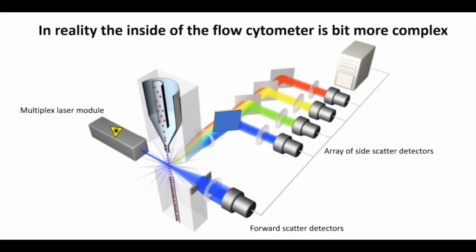So today I will discuss all about flow cytometry, about this technique.